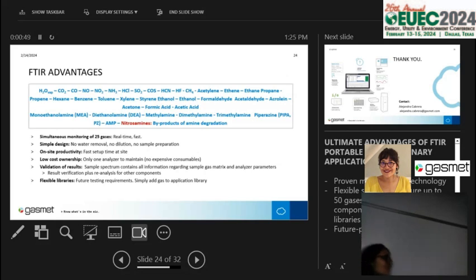Question? Yeah. So we heard this morning that sometimes for CCUS, the CO2 purity is, the pipeliners like to see 99.9% pure. Does FTIR have the ability to detect with that resolution? So when it comes to that high, we can do that. We've done 0 to 100% CO2, which is typically the outlet of the stripper column, the concentrated one. Typically my clients require 95-98% CO2. With the same instrument, it's possible, yes.